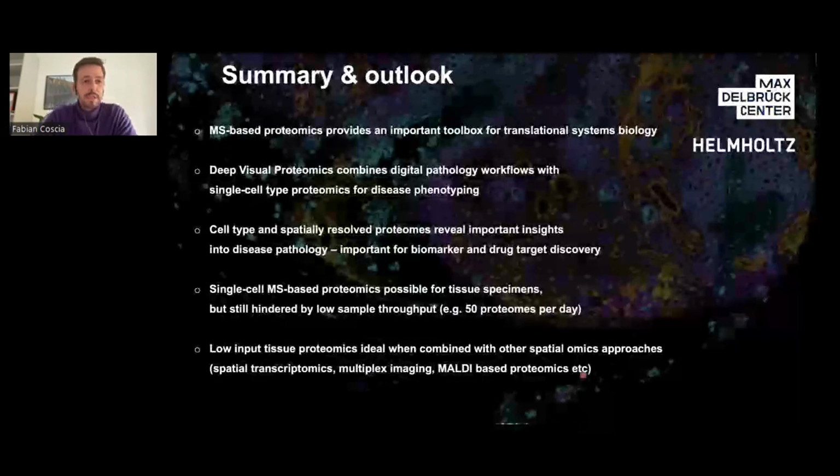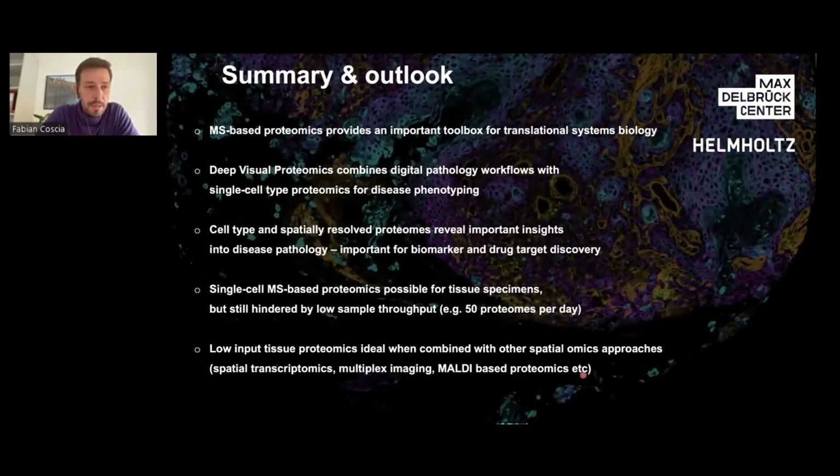So with that, I would like to summarize my presentation. I hope I could show you that MS-based, so mass spectrometry-based proteomics is a very versatile and powerful toolbox, not only for basic research, but also in particular for translational systems biology. We recently co-developed a new pipeline called Deep Visual Proteomics, which combines digital pathology workflows, so mostly imaging-based workflows, deep learning, and single-cell type proteomics to deeply phenotype human diseases.